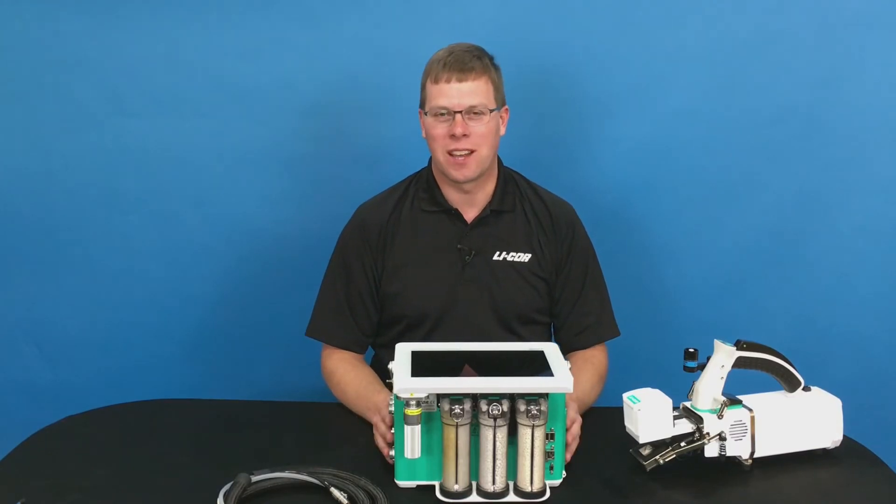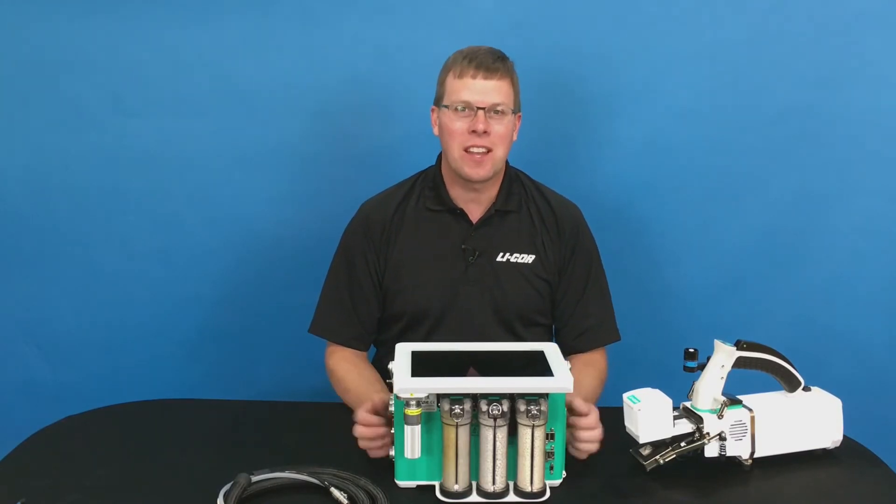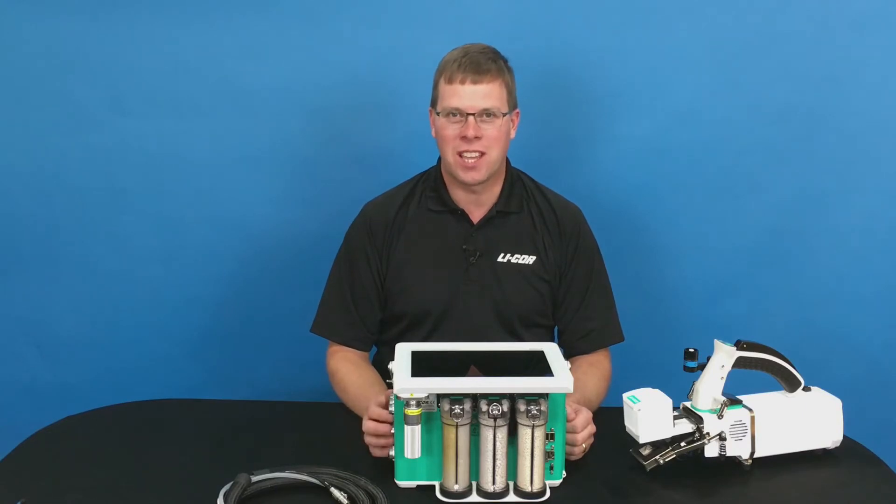Hi, I'm Pat Morgans, Senior Scientist at LI-COR Biosciences. Today I'm going to talk to you about maintenance on the brand new 6800.